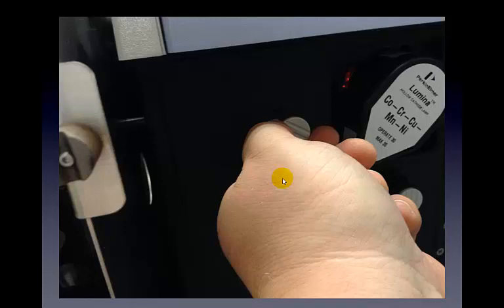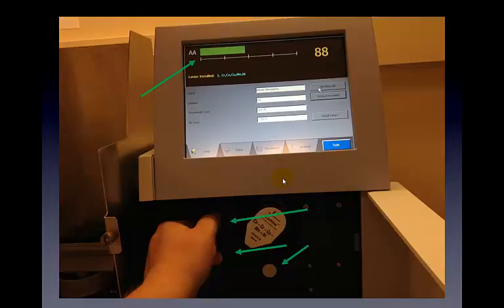The next thing we need to do is optimize the lamp by physically manipulating the angle at which the lamp is installed inside the instrument. We do this by adjusting the three knobs around the lamp as indicated by the three green arrows on the bottom of the screen. We look at the intensity of the light using the green bar at the top of the screen — currently about 88 — and adjust those three knobs to reach maximum intensity.